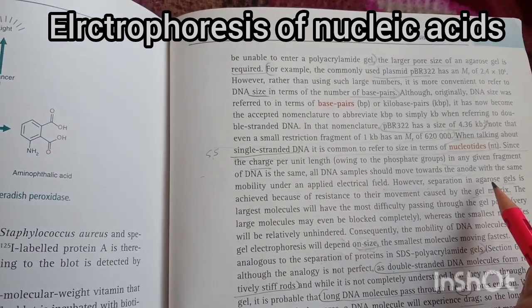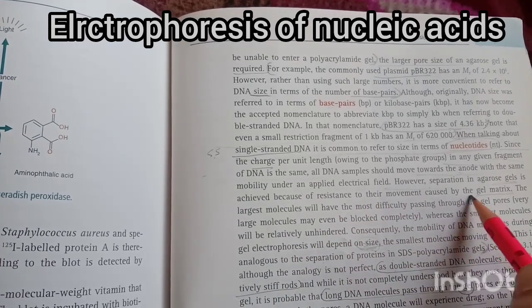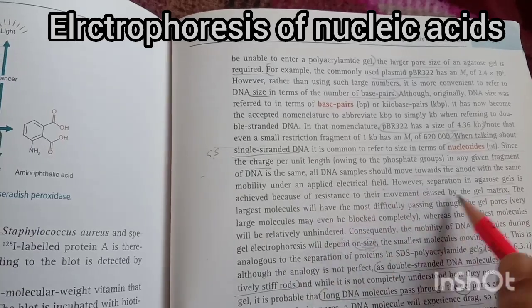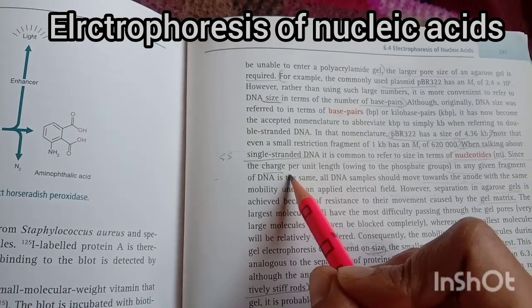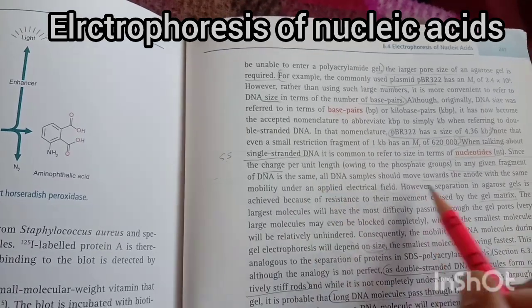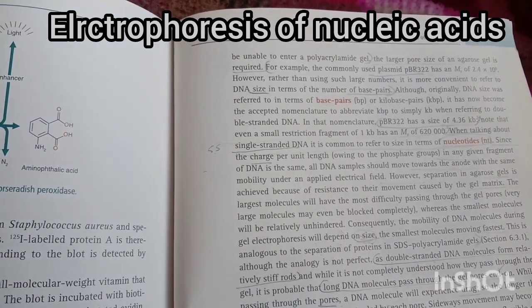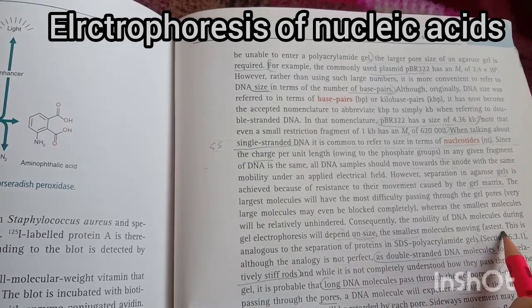However, separation in the agarose gel is achieved because of the resistance to their movement caused by the gel matrix. We can identify slightly on the basis of resistance to the gel matrix, but mostly we avoid charge because they carry the same charge. So that is why the larger molecules we identify by size.